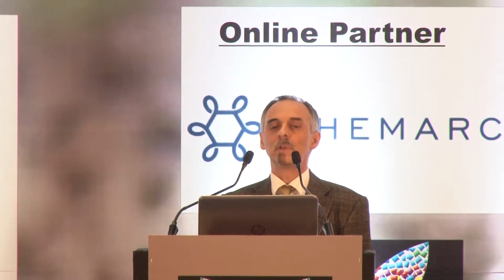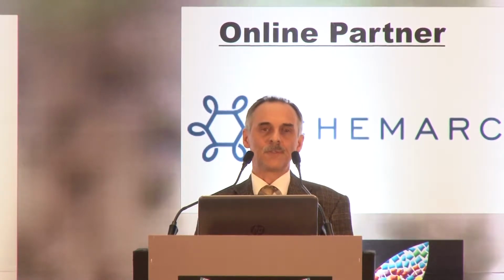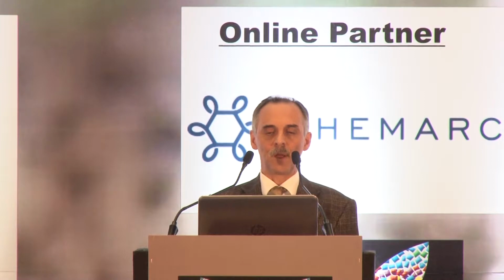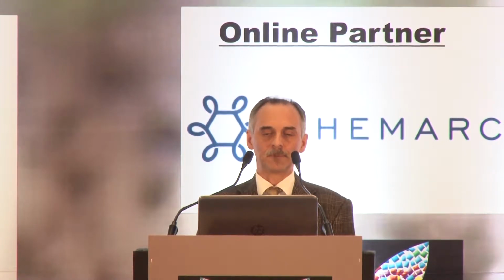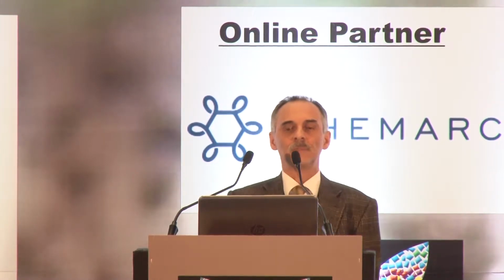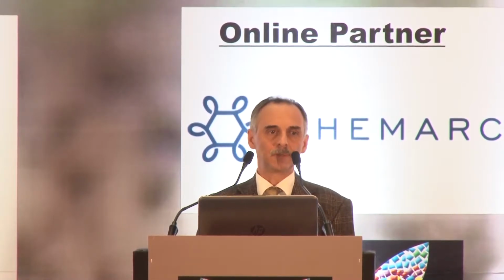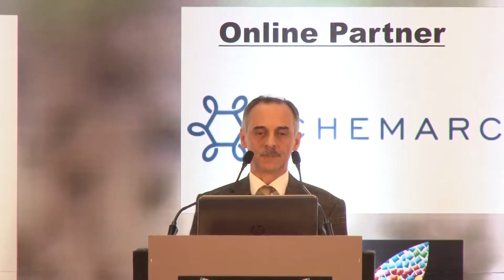There are two test mixtures which are defined in the standard. This is a small test mixture with a total of 200 grams containing 5 grams of pigments. And the larger mixture has a total of 1,000 grams with 80 grams of pigments. The small mixture is mainly used for the test of color pigments, and the larger mixture is more used for the test of black and white pigments.